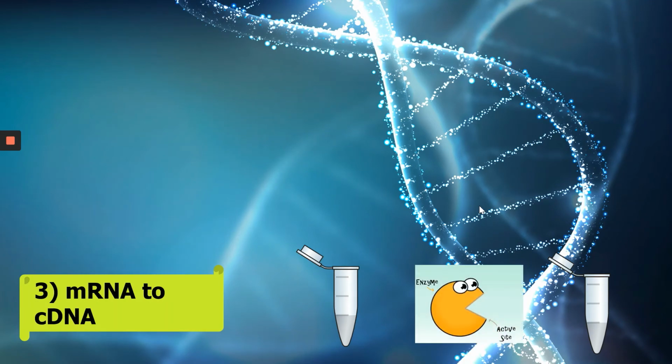So Sarah, an enzyme, if you're not familiar with that, is something that helps us to speed up the experiment. It's like when you're playing a game, you have a cheat code to speed up the game. So that's the same with an enzyme. We use an enzyme to speed up the experiment.